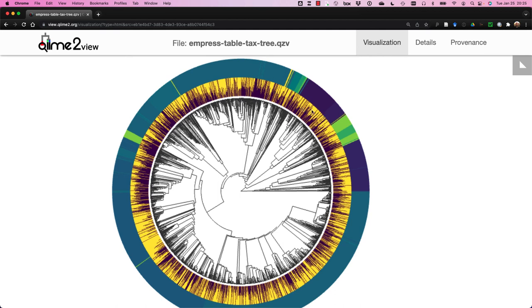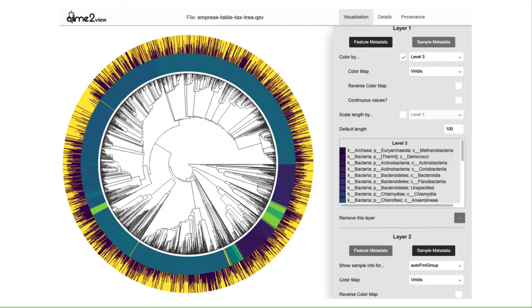This concludes our little demo of Empress. Again, this is not required for the rest of the workshop. This is just a nice little bonus feature that we thought would be nice to present to you all. We look forward to all of your amazing Empress visualizations. Feel free to share them with the community on the QIIME 2 forum. Until then, remember, there is always a very happy tree behind every Empress visualization.